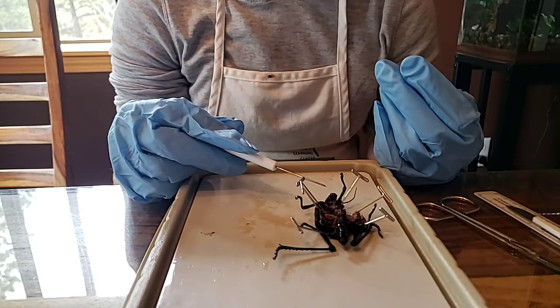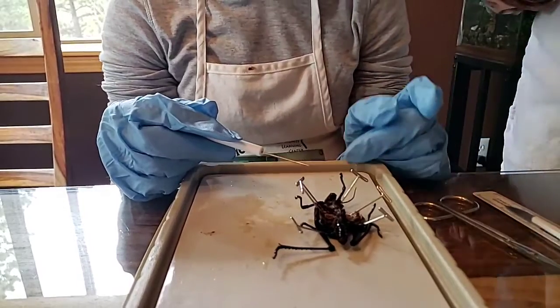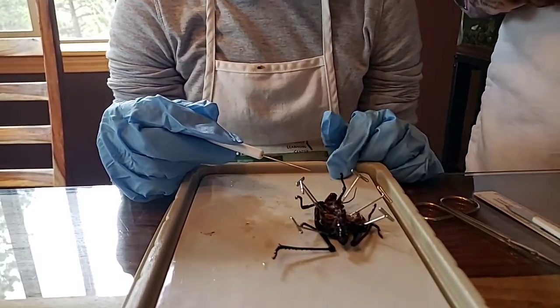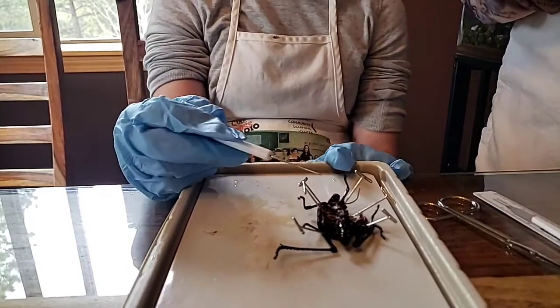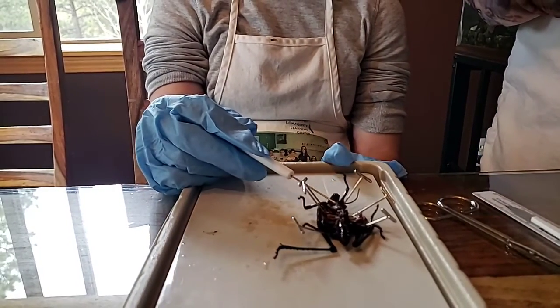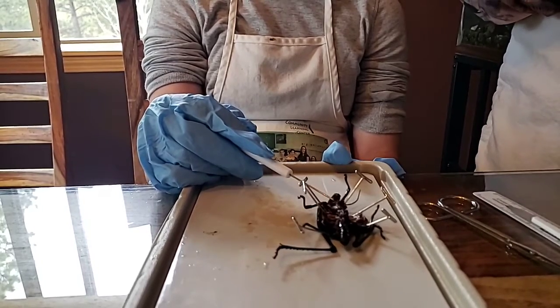Lanston, please go sit next to your sister so you can look at her specimen. Whoa, look at this. Stand didn't get preserved very well, so the insides are all just kind of squishy. Okay, so once you've pulled the sides apart, you're going to notice the tracheal tube running into the internal organs. So you go up by the head, further up, further up. It's going to be right up there.